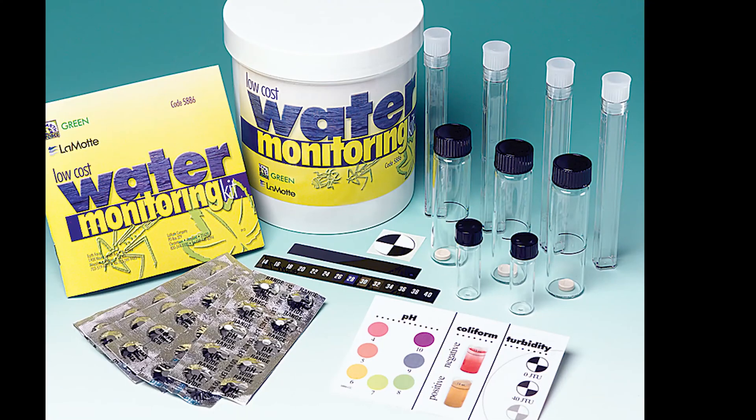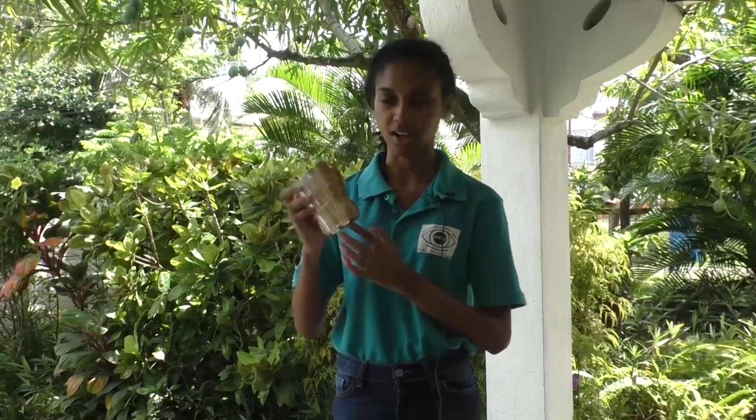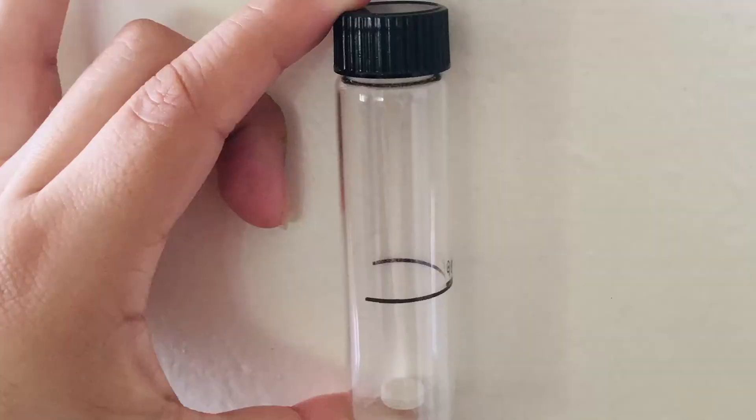Everything you need to conduct this experiment is found right in this kit. We have four test tubes which allow you to conduct pH, nitrate, and phosphate tests. We also have the coliform bacteria test tubes — there are three — and in there you can find the tablets.